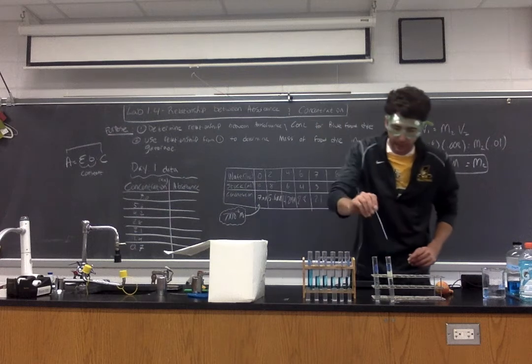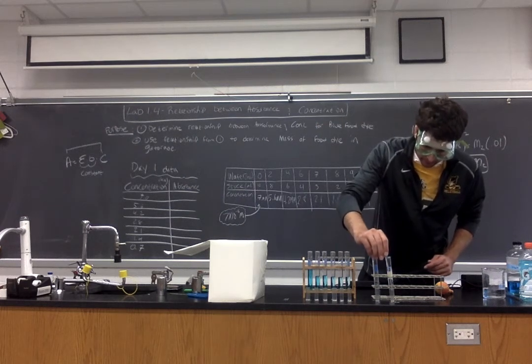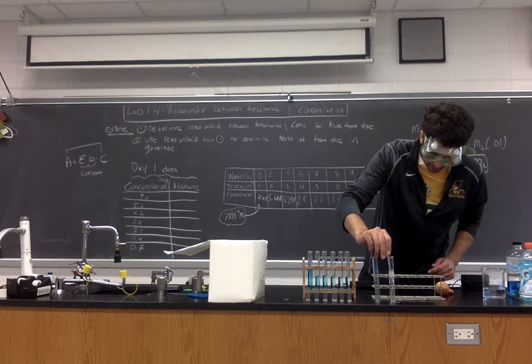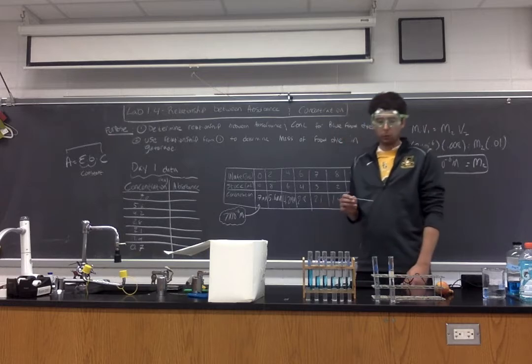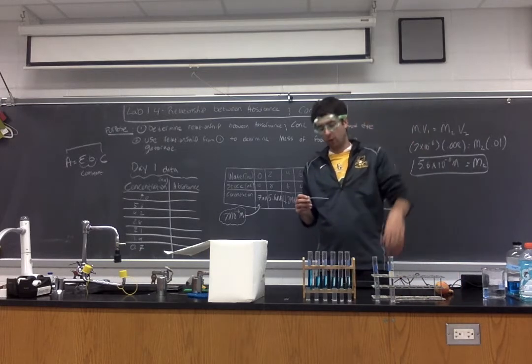So we're simply going to take our deionized water trial using a plastic pipette, and we are going to fill up the cuvette with deionized water. You don't need to fill it up all the way so it's overflowing. About 3/4 full will work. We just need to make sure that the light will go through liquid only.